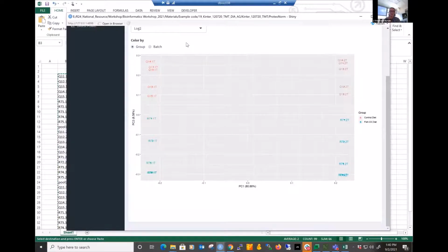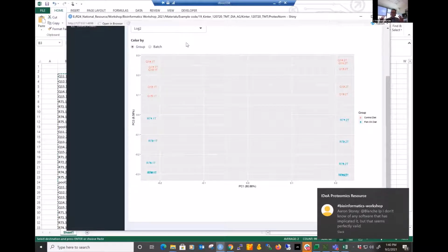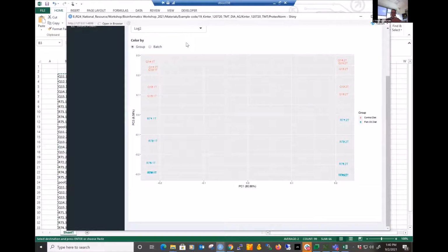One other method that I've used in the past is you can use a ComBat function for microarrays to try to break those batching effects. Again, it's kind of an older method, and which one's best is hard to determine when you don't have a standard in the experiment. But what you would do with ComBat is you take those 2 different batches and you have to normalize those separately. And then you could do the ComBat approach to break that batch. And if I do that and I show PCA, then you actually can start seeing the batching effect break.